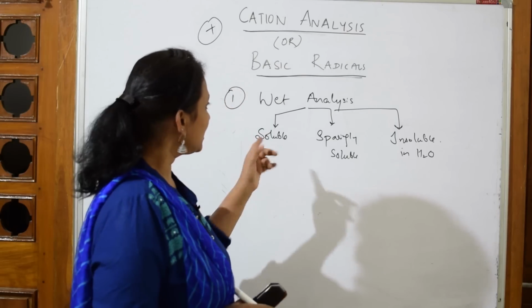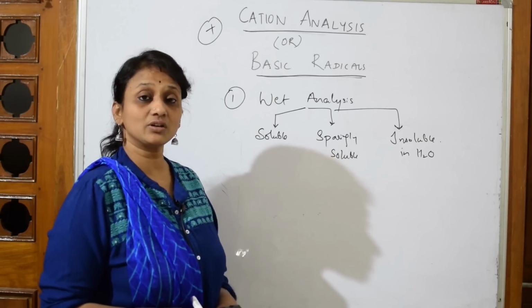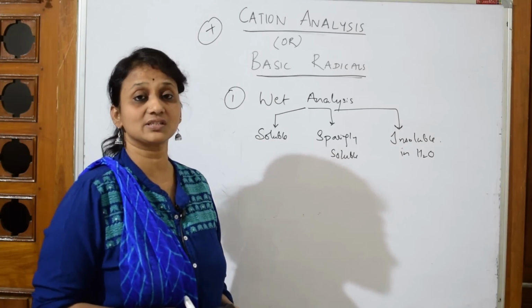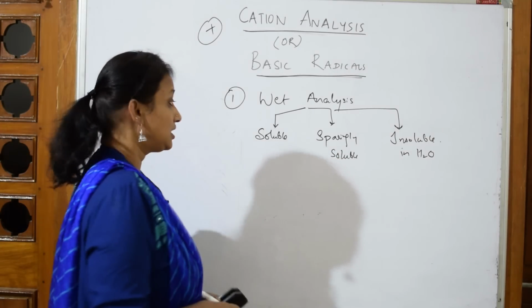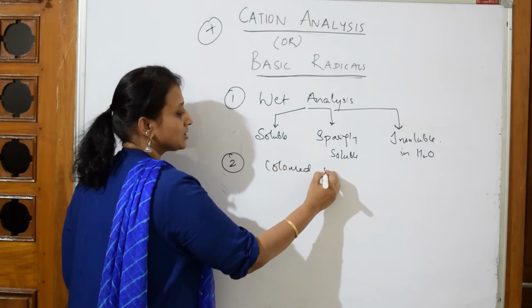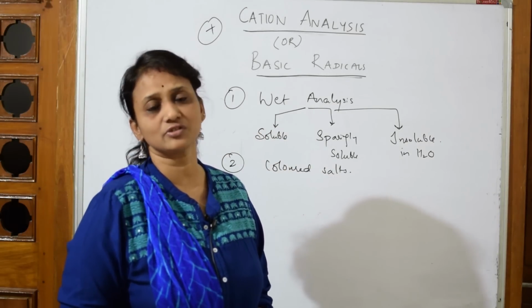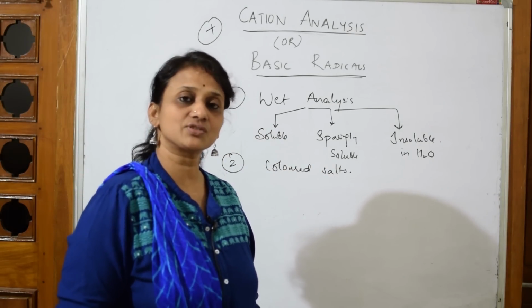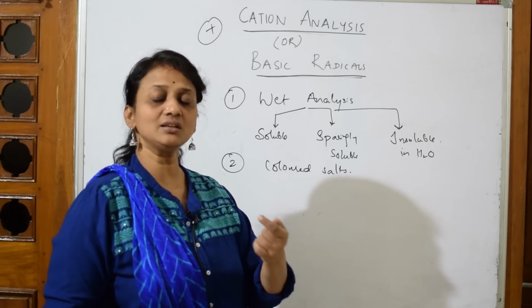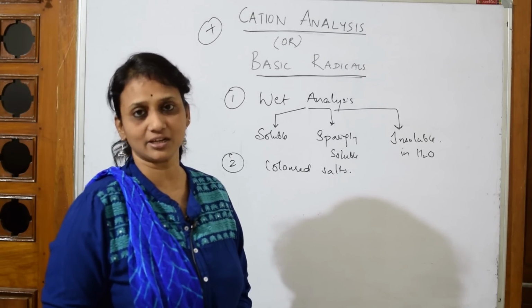Again, after doing the wet analysis, I'll analyze the colored salt if it is given to me. I'll be teaching which colored salt represents which ion. I have to tell you, in the maximum number of schools colored salts will not be given. CBSE has suggested giving only white colored salts. With colored salts, it's easy to depict the cation.